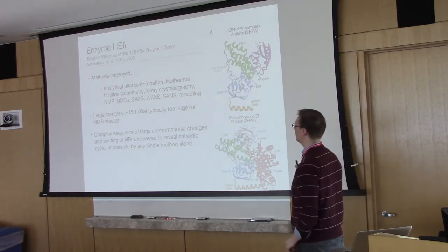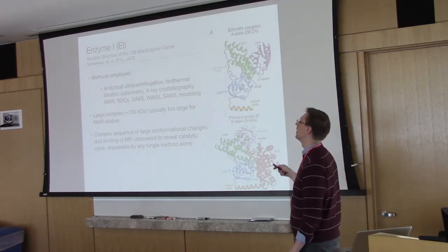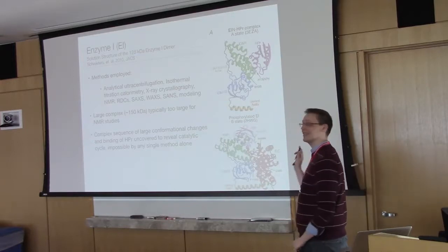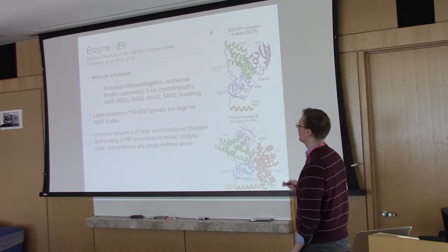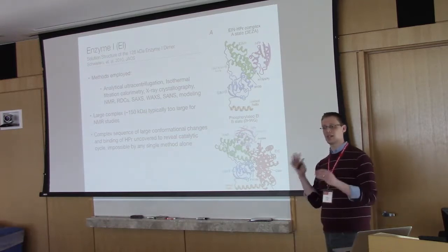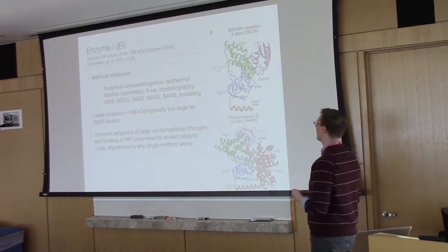And I'm not going to go into everything because you can just read the paper. Have fun. It's a long paper because they did so much, but it's a really nice paper, I think. And it's really a large complex, which is typically too large for NMR. They use NMR as one of their core pieces, but it's a large complex.